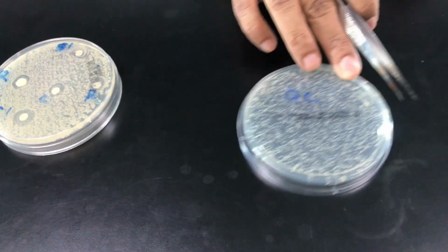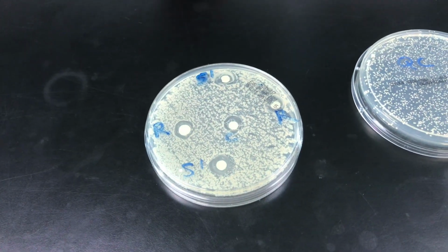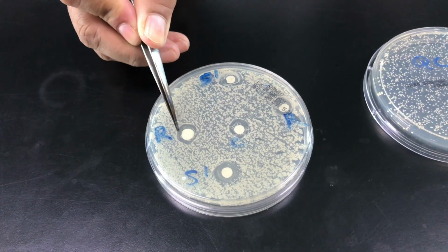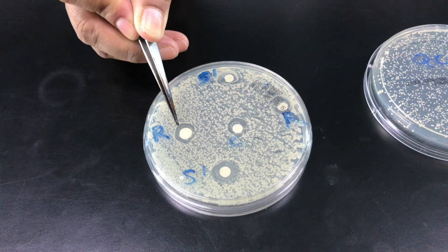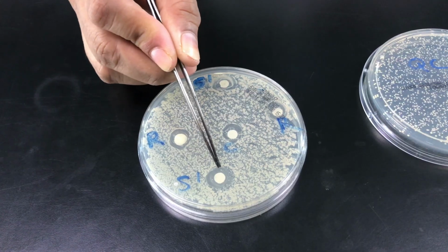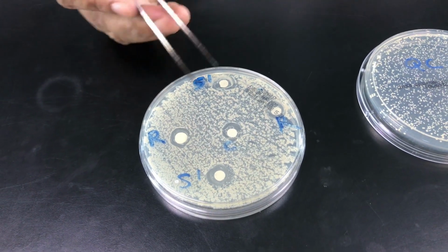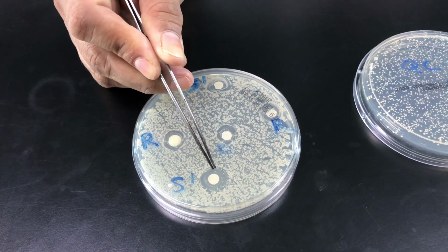But when you do the inhibition with the paper disc, inhibition of antibiotic, then there's a clear zone produced around the paper disc. So this clear zone, the diameter that is produced by the clear zone, gives us the information to plot the standard graph to say how much Nisin is produced.